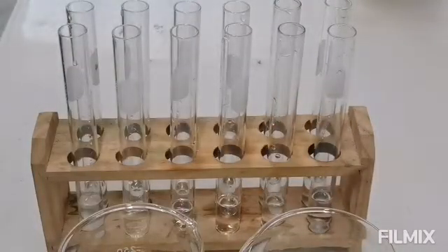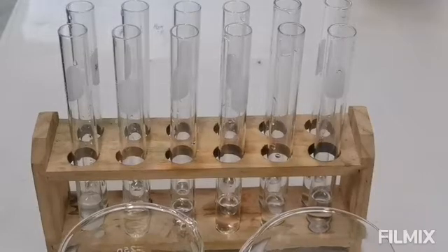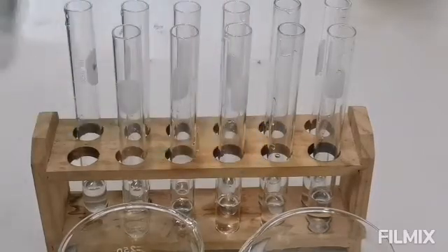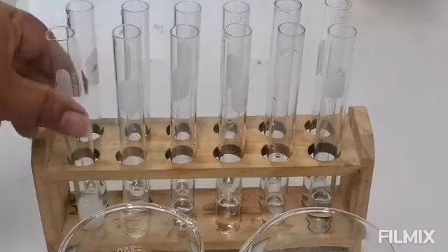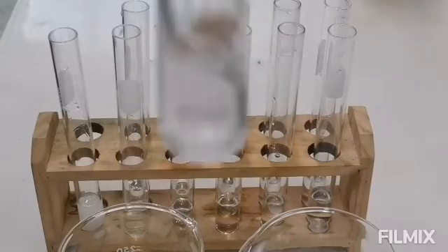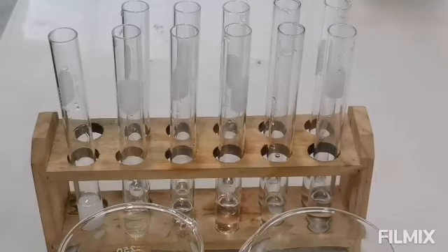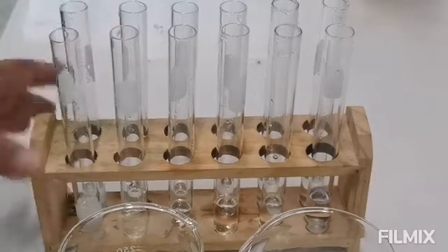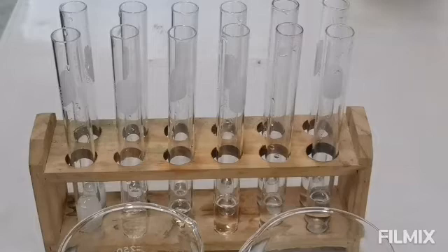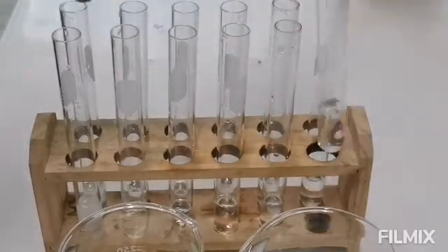So the first thing that we're going to do is to test whether there is protein present in these two things. So this is already a solution of sodium hydroxide. We're going to shake it so that it will mix better. And then we have also another test tube with sodium hydroxide. The first test tube will be used for albumin, and the latter one will be used for the beef extract. So this will serve as your test tubes 1, 2, 3, 4, 5 for the test of protein. This one is a sodium hydroxide solution.